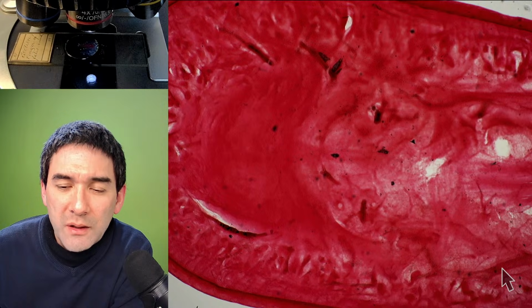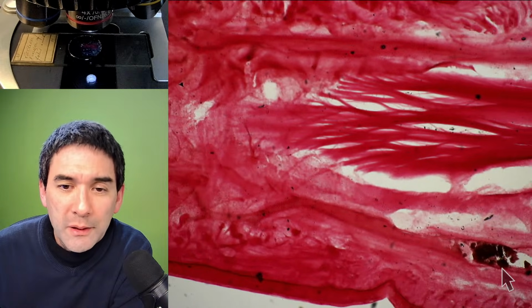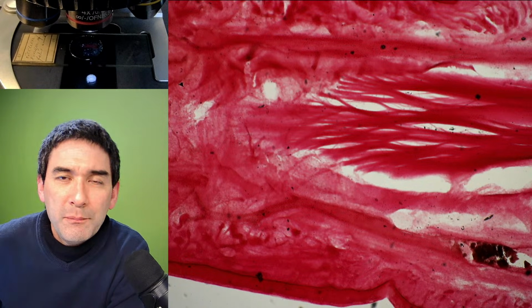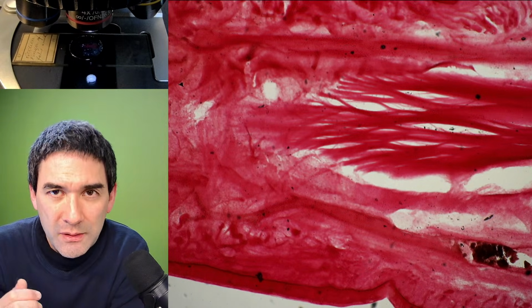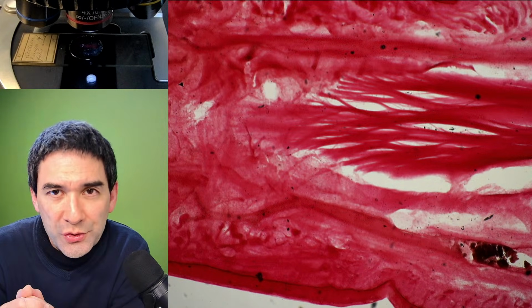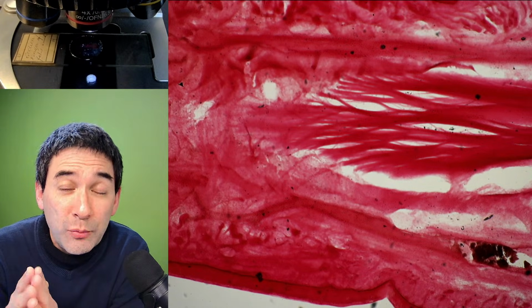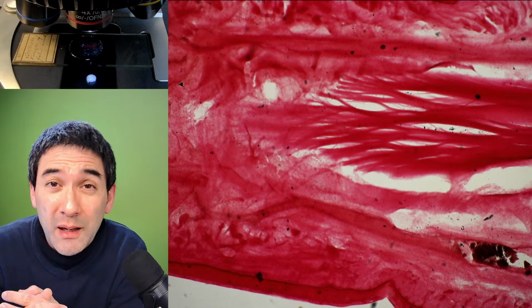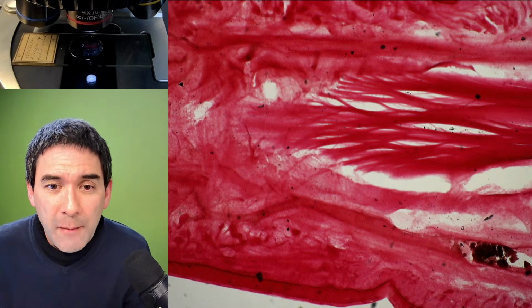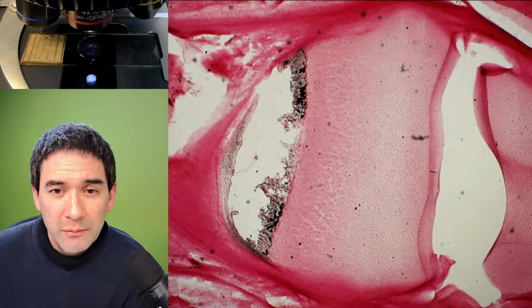Did the maker of the monkey tail slide mention the preservation method? No. But at that time, people used Canada balsam a lot as a mounting medium, so I suppose that it was also used. It's a simple histological cut. It was dehydrated, I'm quite sure, embedded in paraffin, and then mounted in Canada balsam. It does not say on the slide, but at that time, Canada balsam, to my knowledge, was extremely popular.